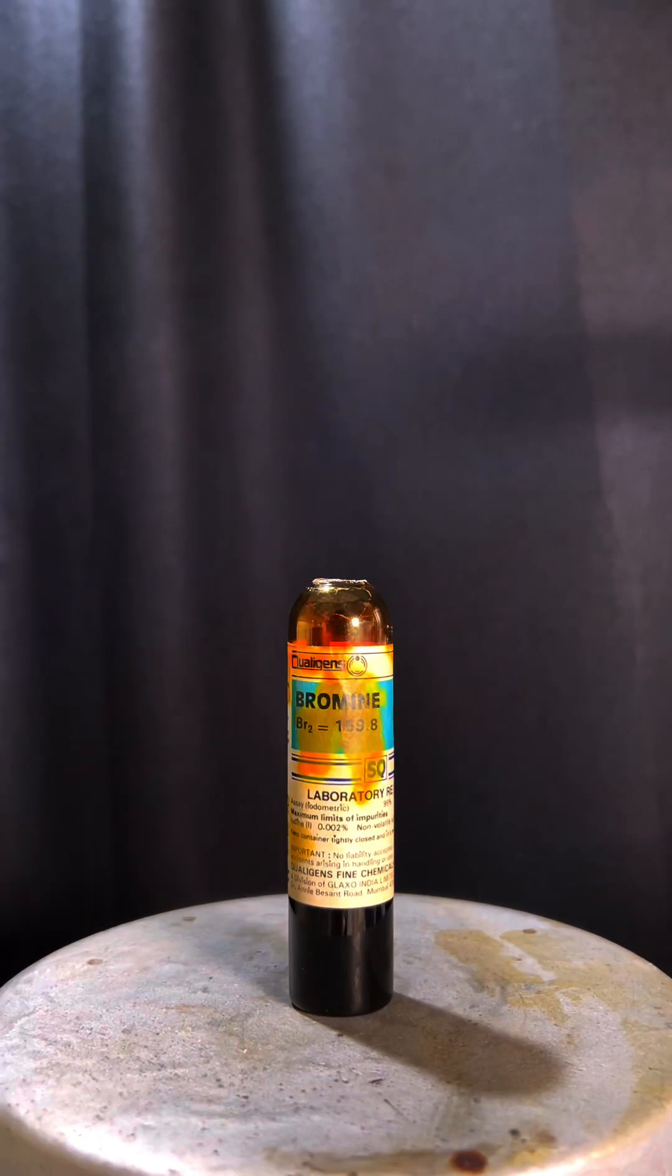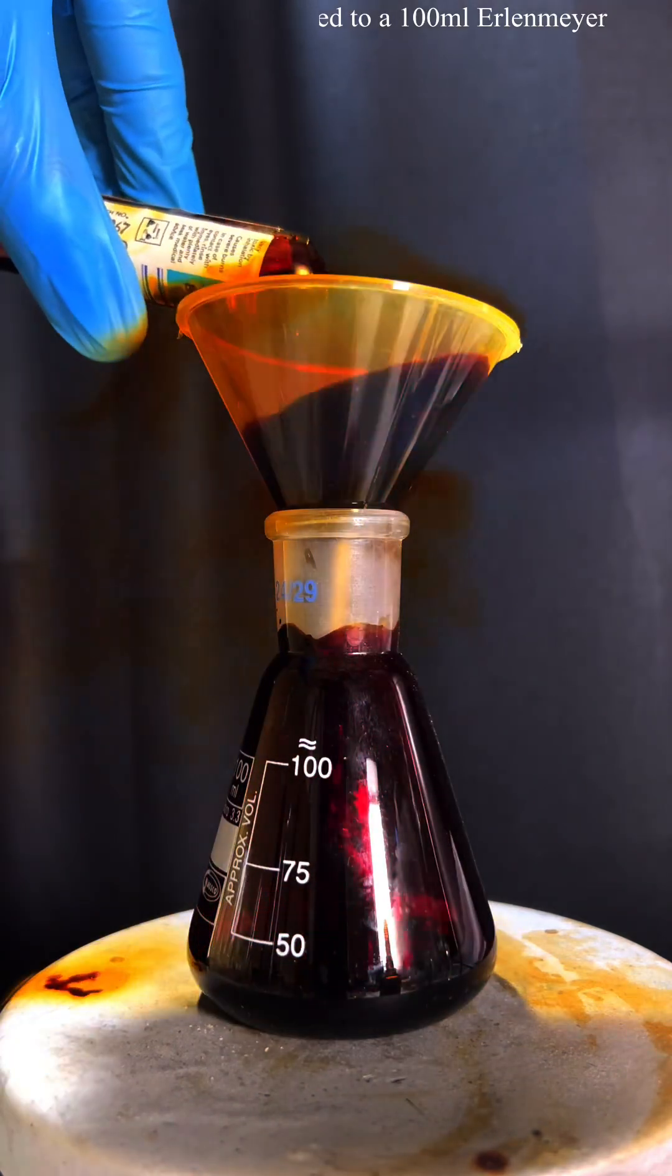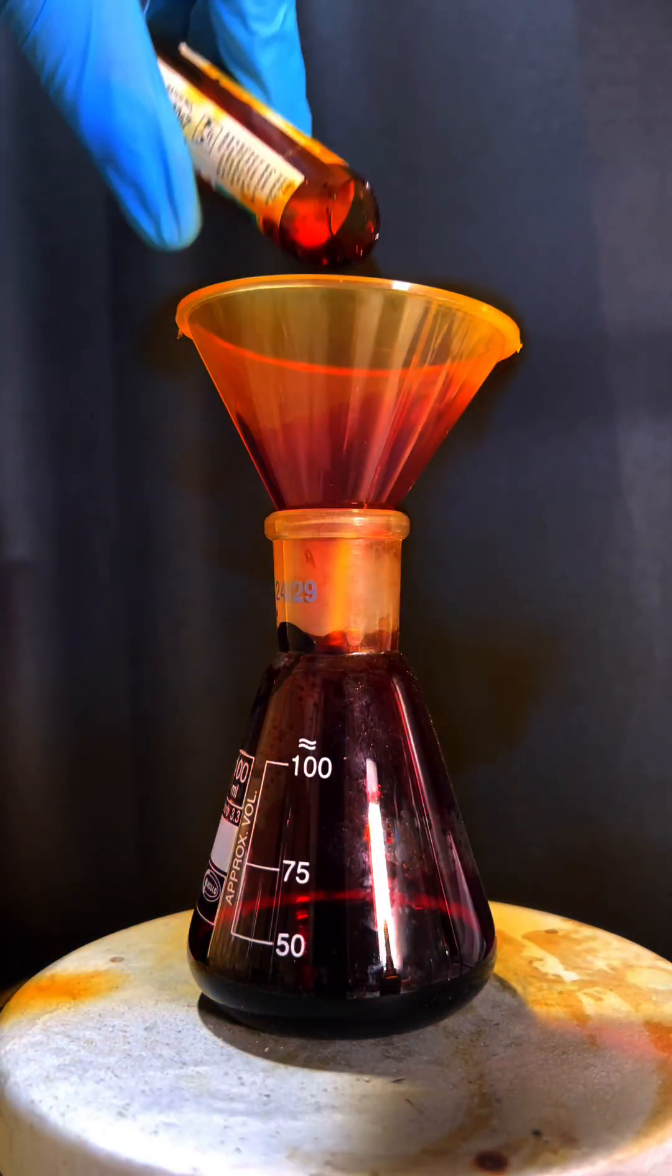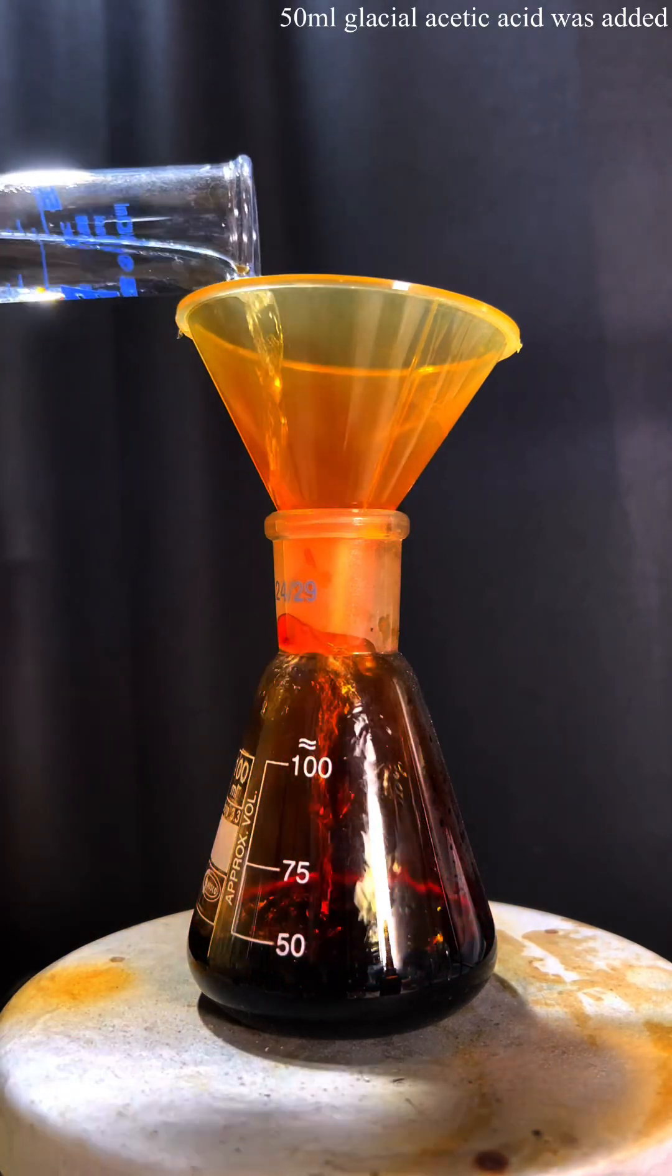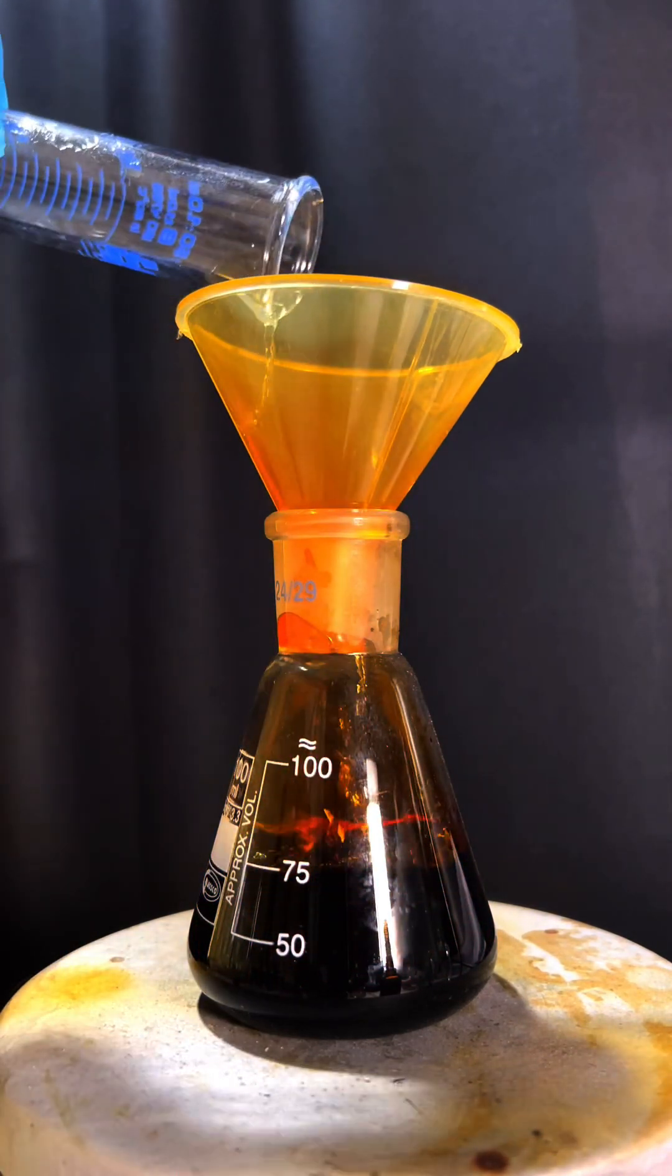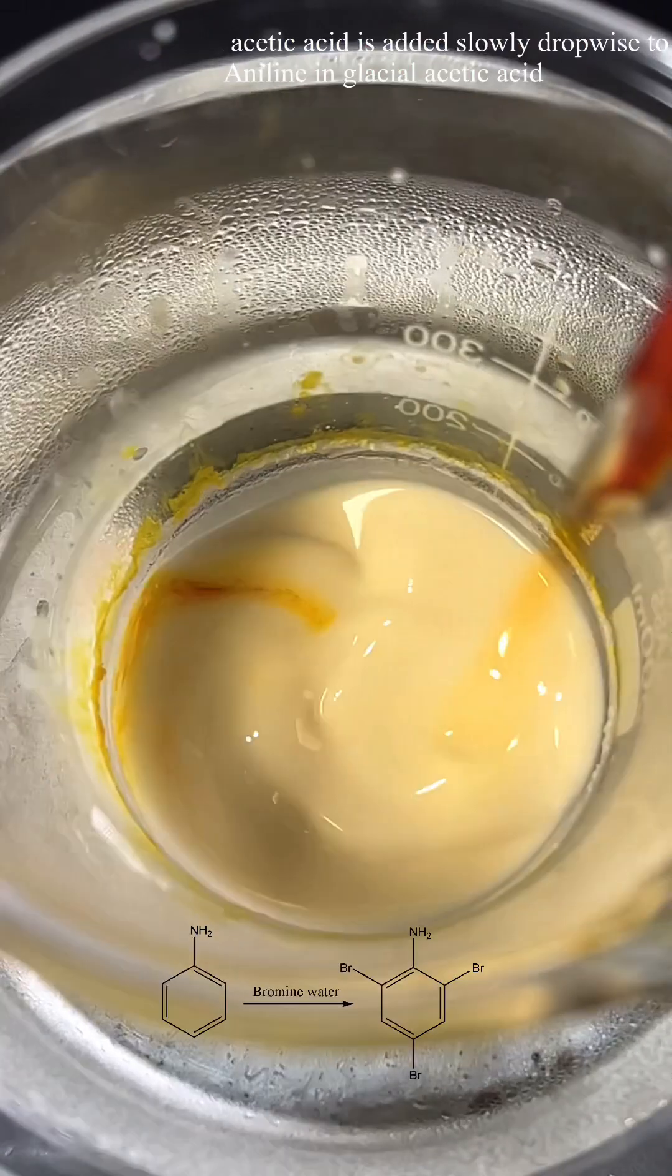Next, 20 ml of bromine was taken and transferred to a 100 ml Erlenmeyer flask. Then 50 ml glacial acetic acid was added to the bromine. The bromine in glacial acetic acid was then transferred to a separatory funnel and was added drop-wise to the aniline in glacial acetic acid.